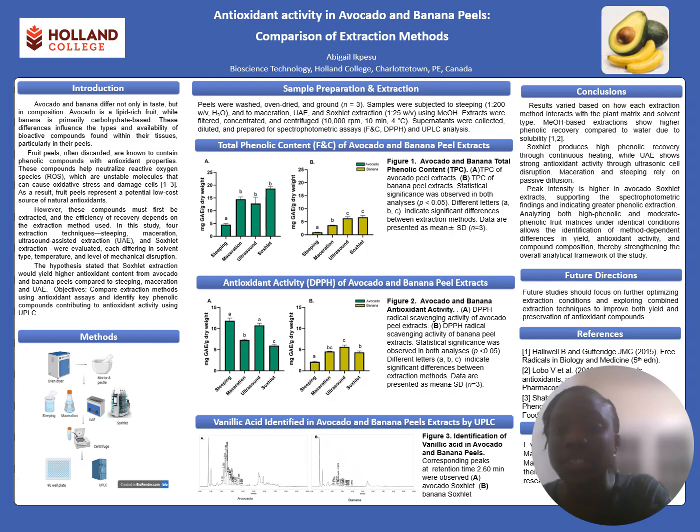The Soxhlet produced high phenolic recovery through continuous heating and solvent reflux, while UAE showed strong antioxidant activity, not the highest, but prominent, due to ultrasonic cell disruption, and maceration and steeping relied on passive diffusion. Peak intensity is higher in avocado Soxhlet, supporting the spectrophotometric assay here, showing that the findings indicate greater phenolic extraction.